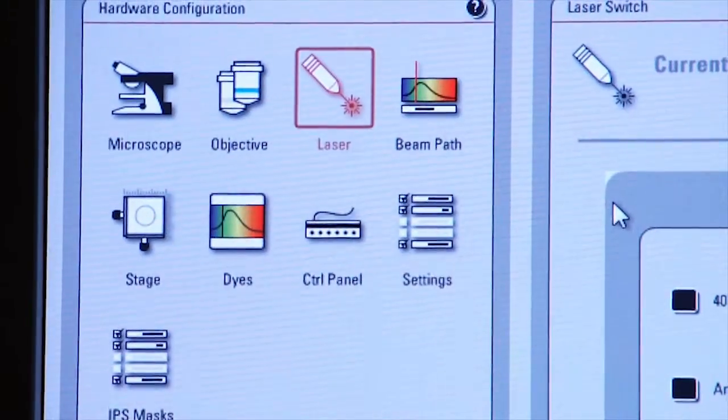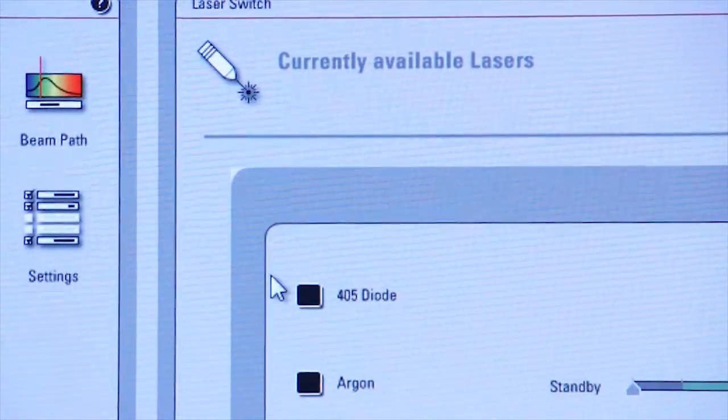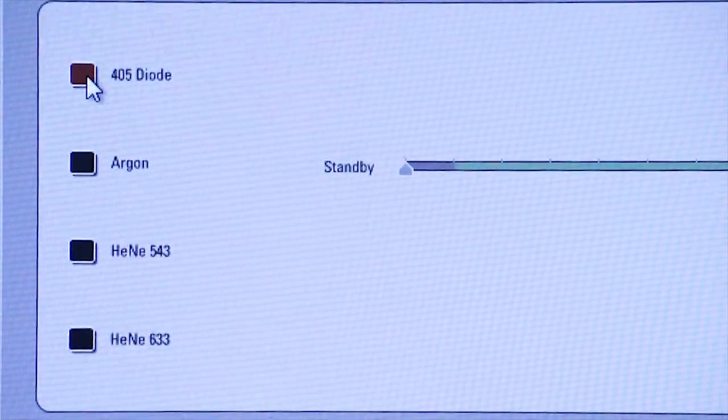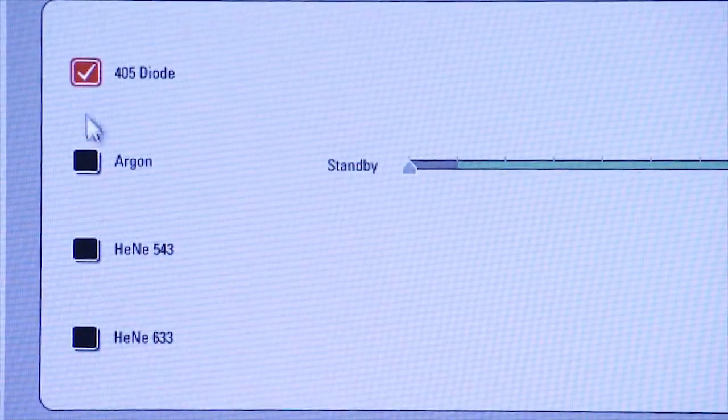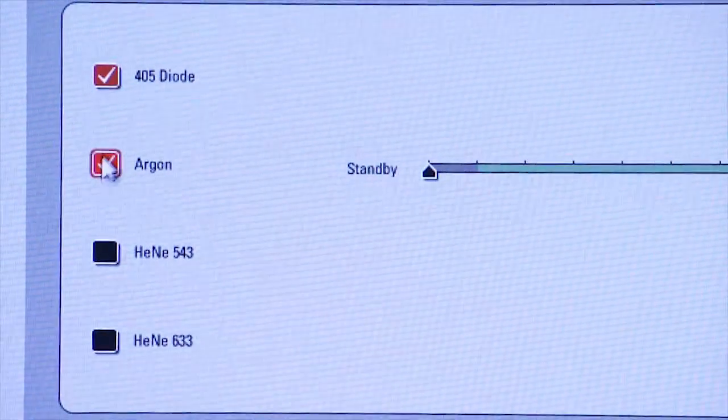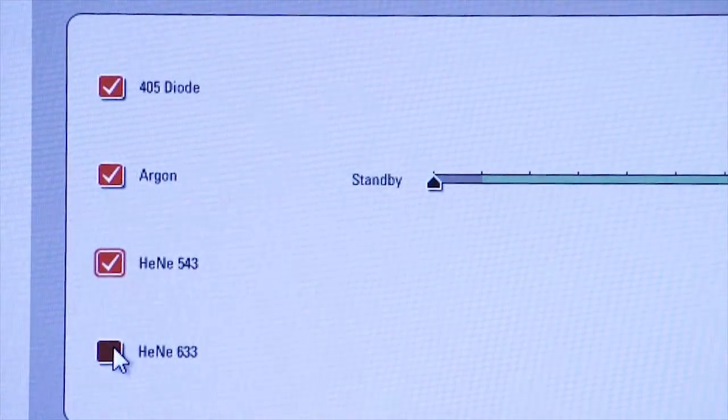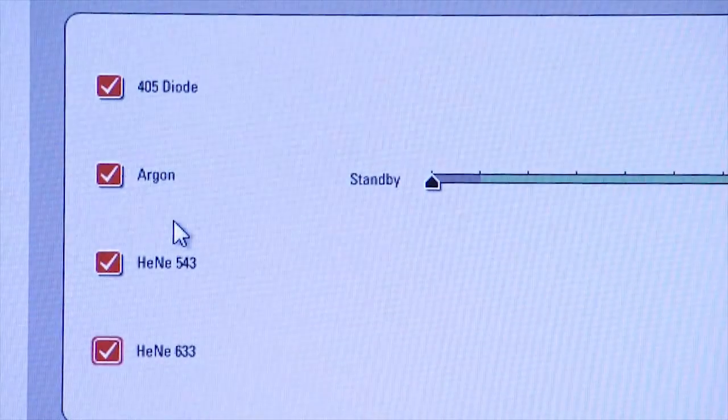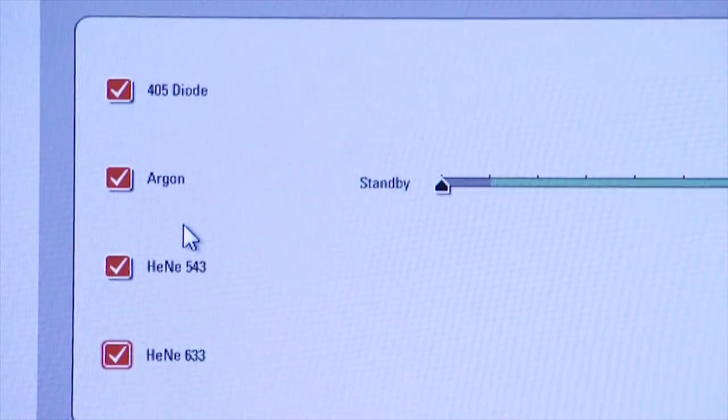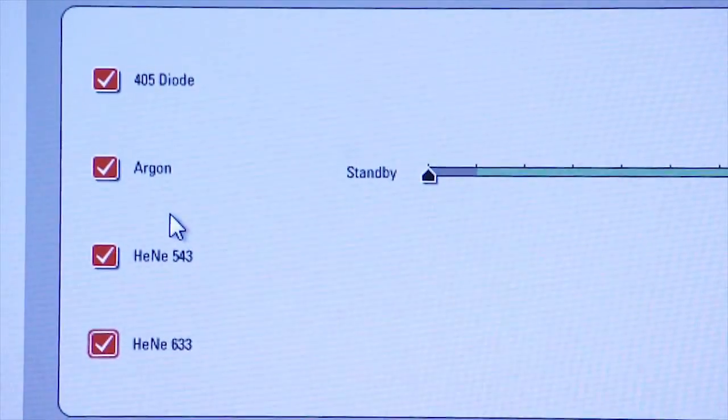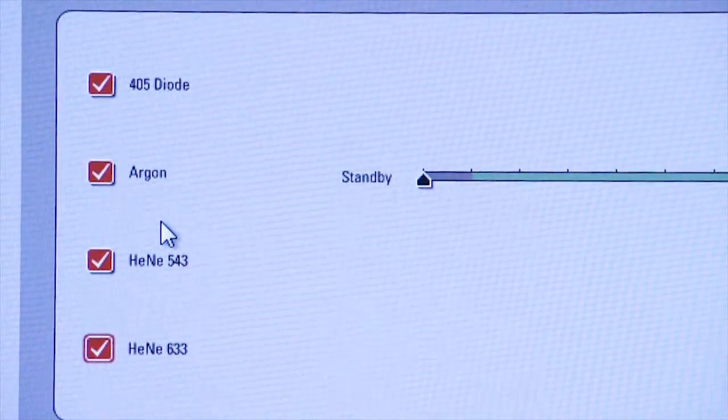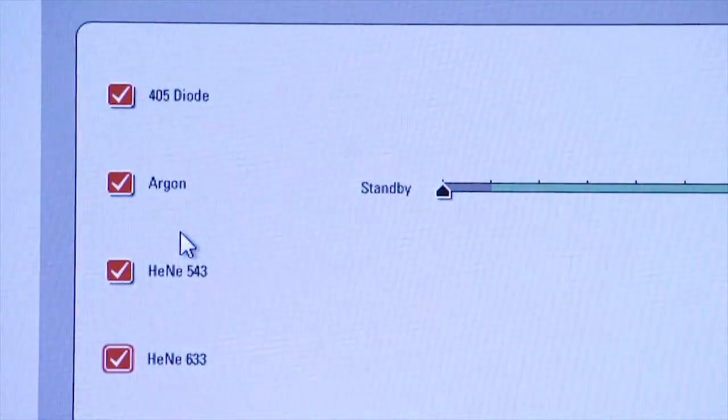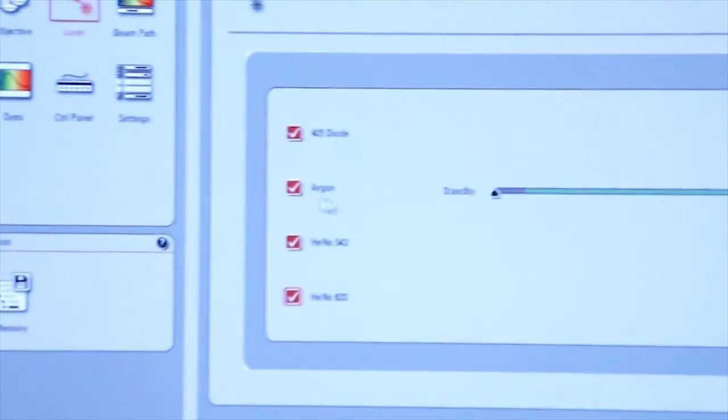You see another screen come up that allows you to power up the available lasers. Let's go ahead and apply power to each one of the lasers. You might hear fans start up which cool the lasers because they generate a lot of heat.